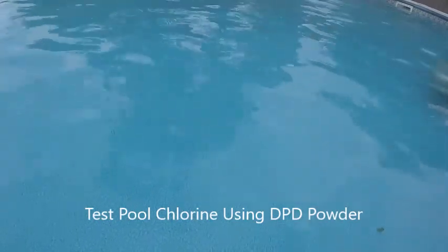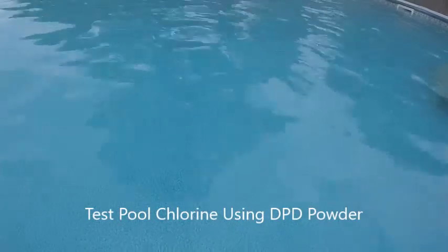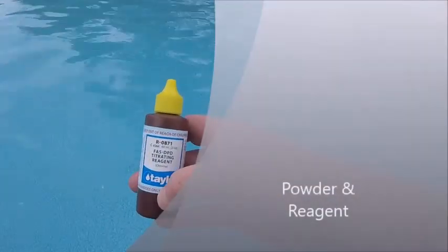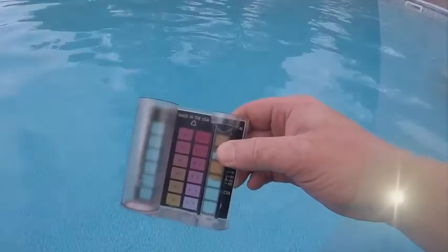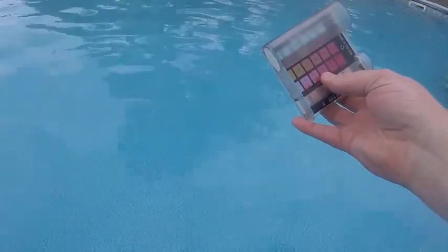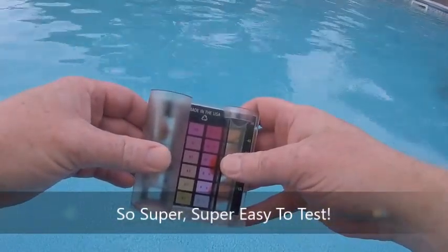Hello. What we're going to do today is test the chlorine levels of the pool using DPD powder and the FAS-DPD titrating reagent. Simply you're just going to need a bottle of this and some of this powder. You'll need a tube that has a 10 milliliter line. This is a real simple process and a real accurate way to determine how much chlorine you have in your pool.